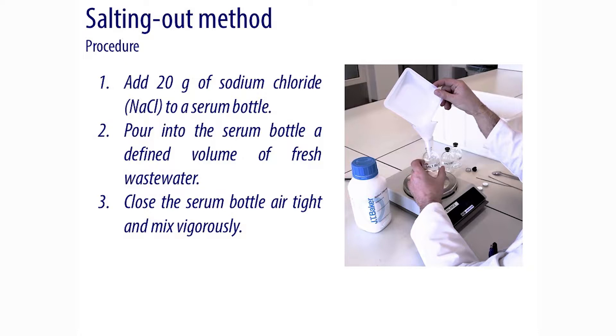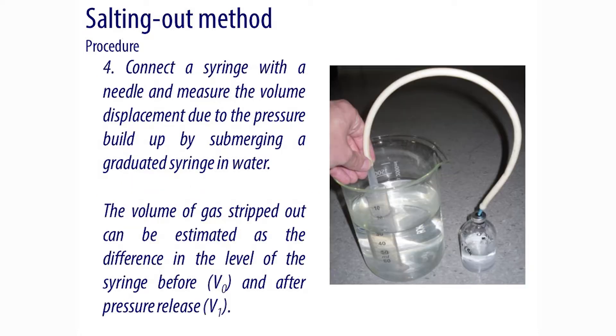Then, in situ, pour into the serum bottle a defined volume of fresh wastewater. Immediately after pouring the wastewater into the serum bottle, close it airtight with a cap and mix vigorously.